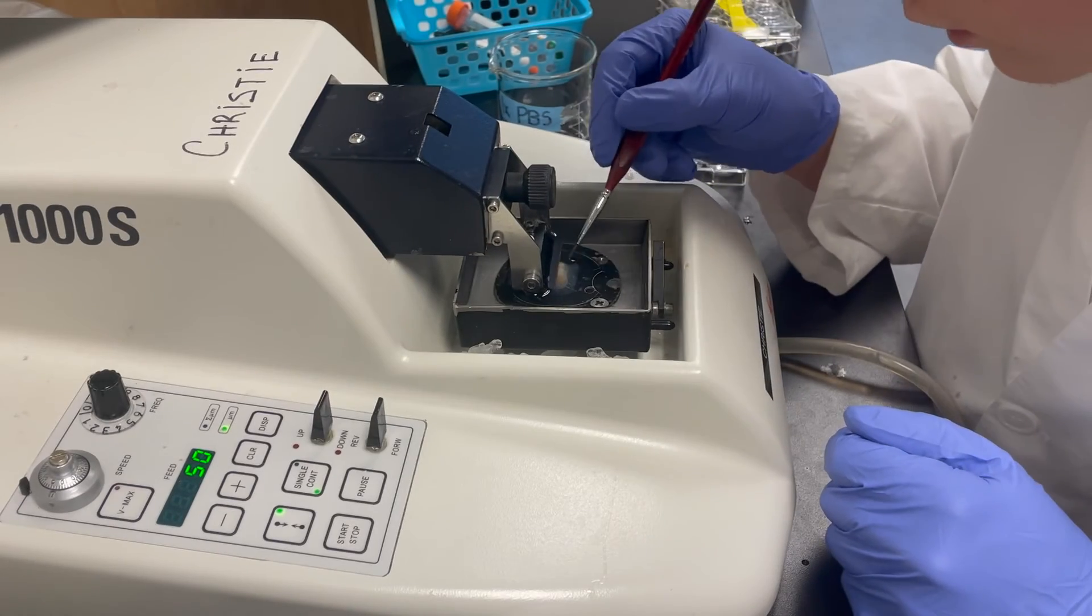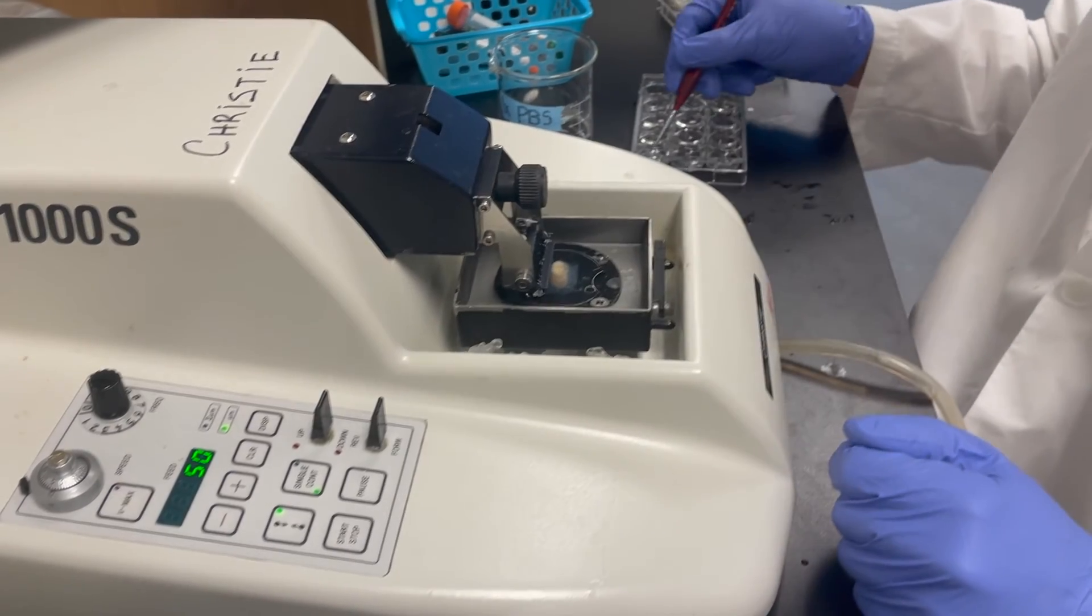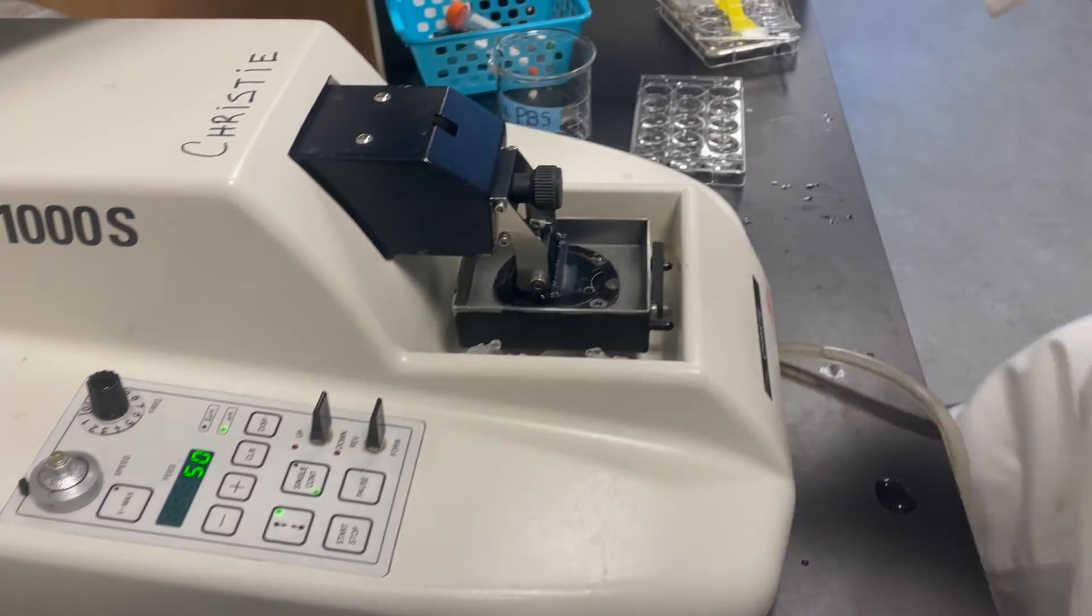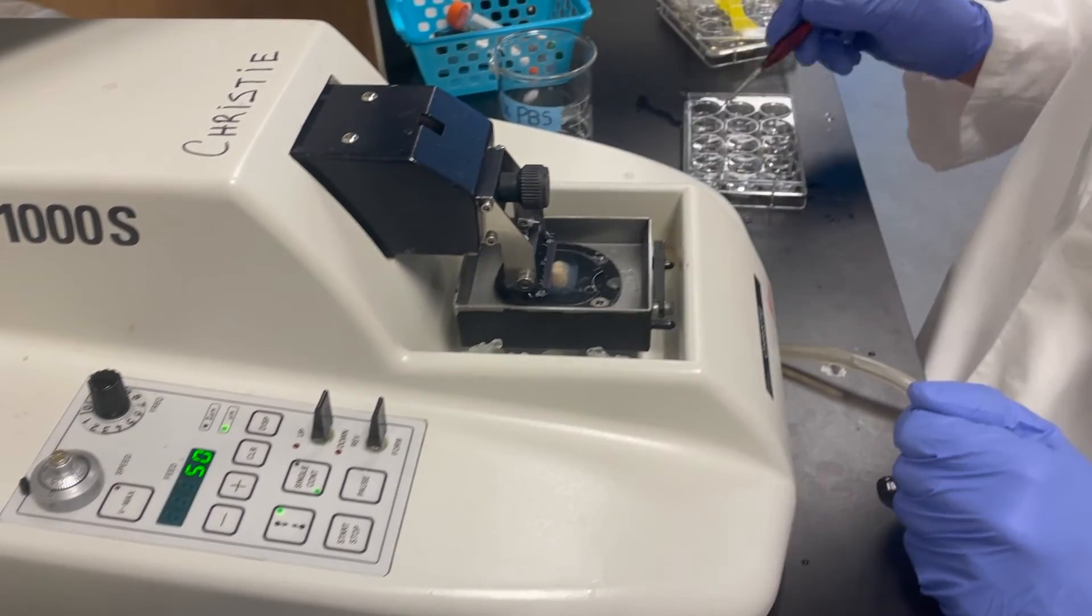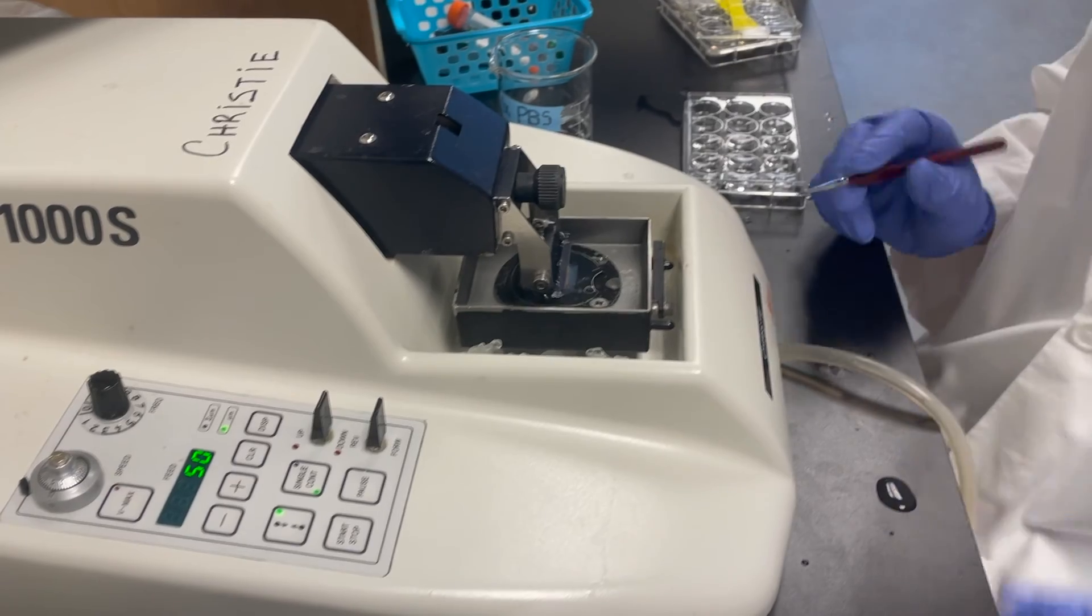We use a fine paint brush to transfer the slices from the tray into the well plates. To keep everything organized for subsequent experiments, slices are transferred in a series of 12, hence why we use the 12 well plates.